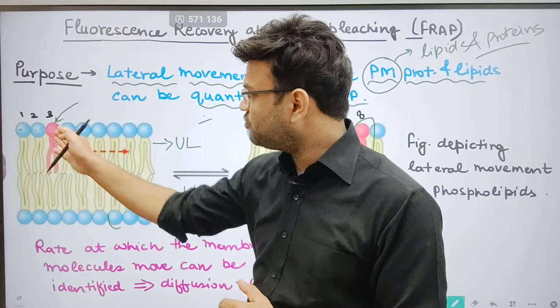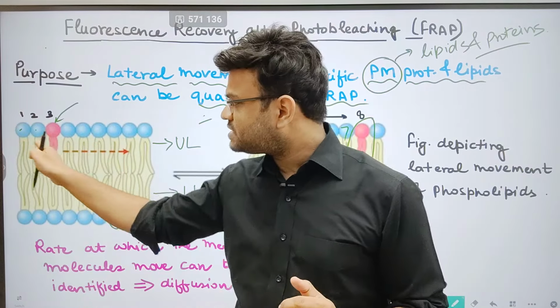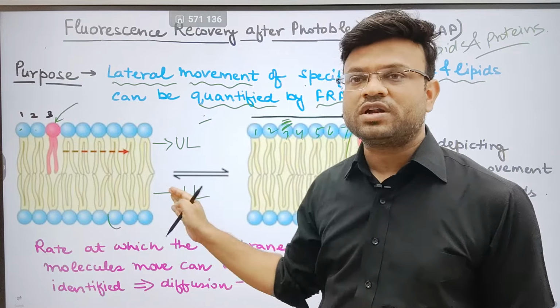I am not saying that the movement will be from here to here. Lateral simply means movement in the same leaflet. If it is in the upper leaflet, it is moving in the upper leaflet only. If it is in the lower leaflet, it is moving in the lower leaflet only.